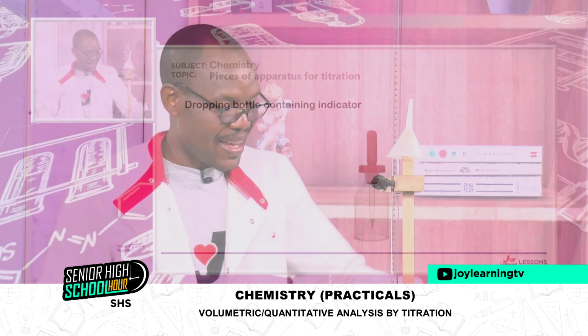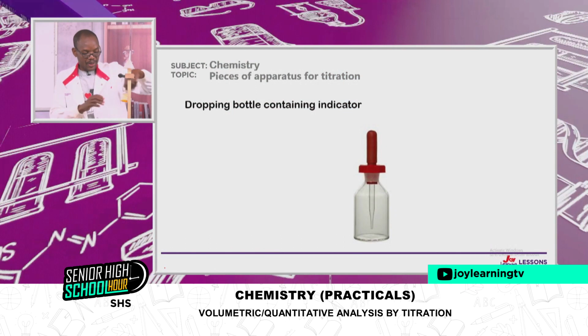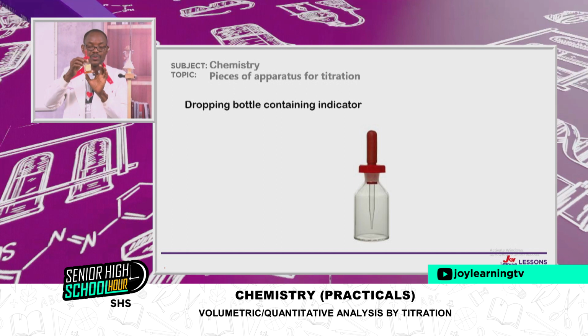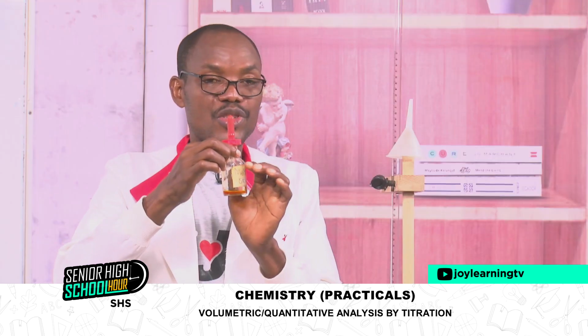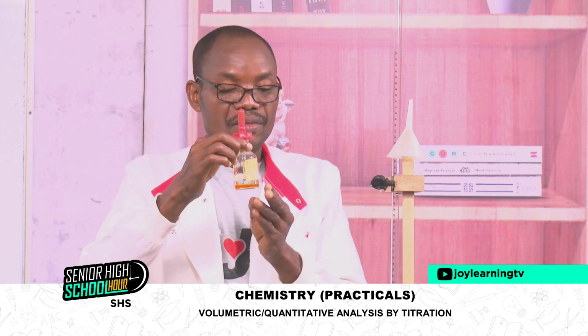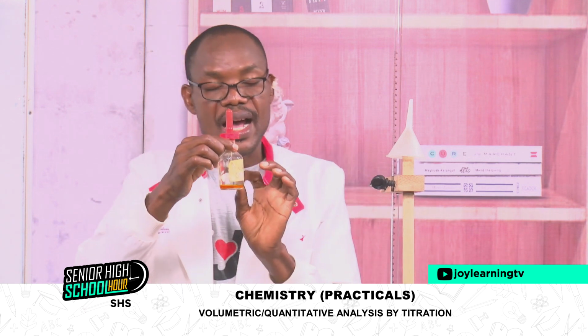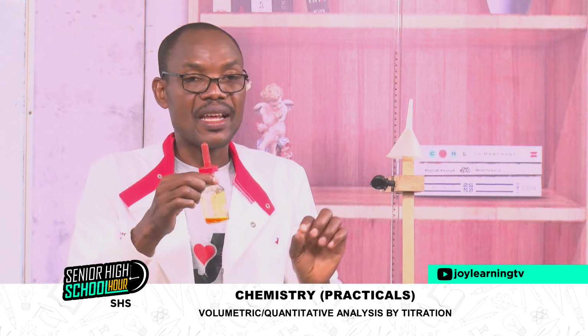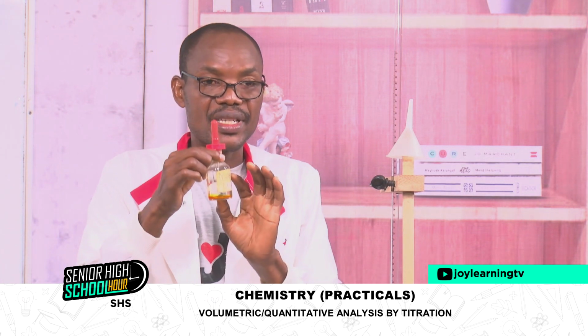The next thing is our dropping bottle. And the dropping bottle contains an indicator that we use in the volumetric analysis. The indicator is a weak organic acid or base that has distinct color in acidic medium and then another color in a basic medium.